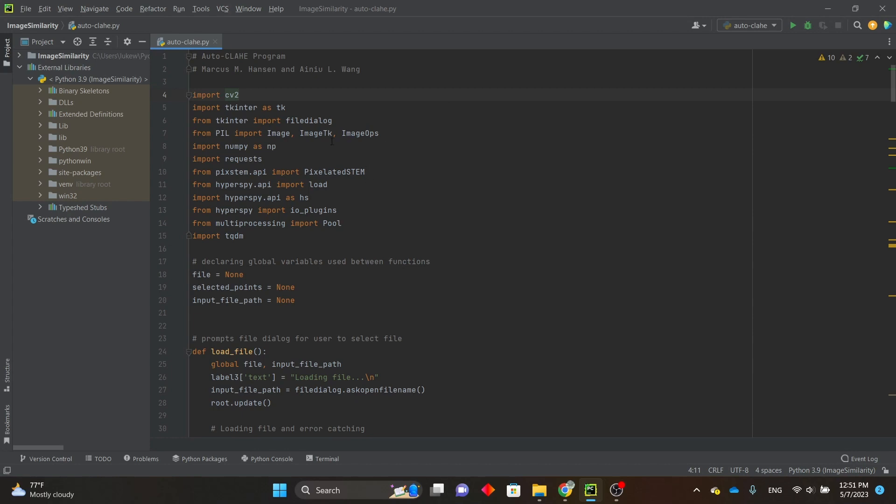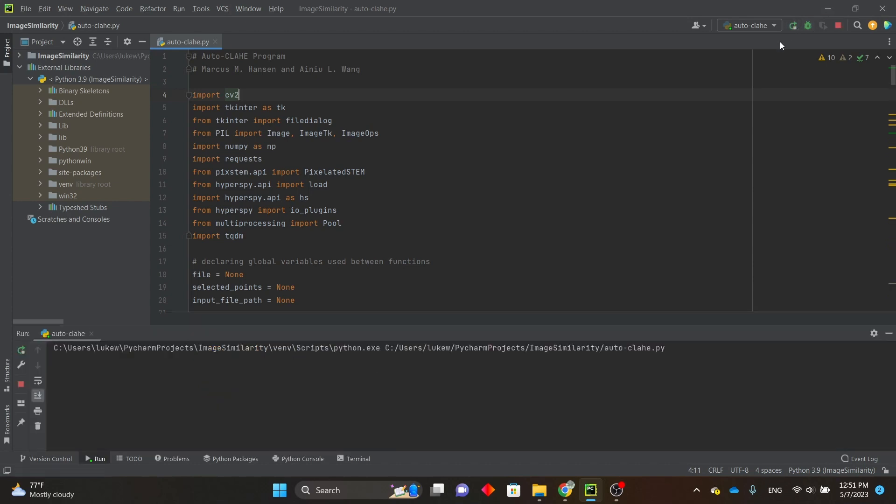Once you have the Python file and all of the required libraries and modules downloaded, you can run the program, and this will bring up a user interface.